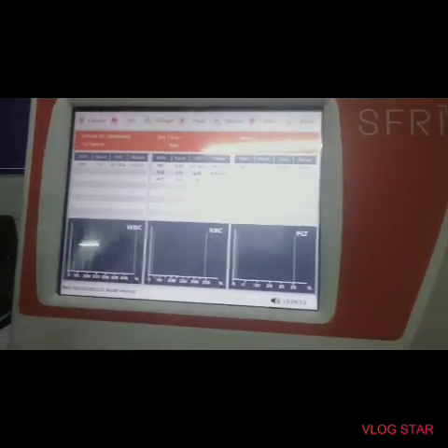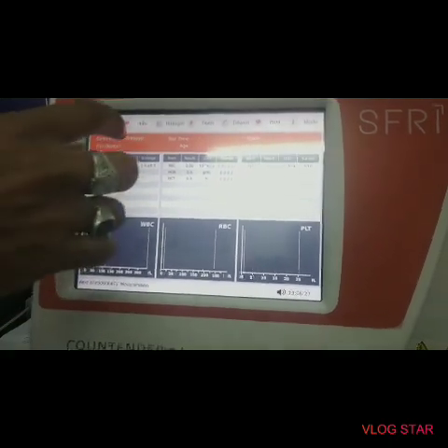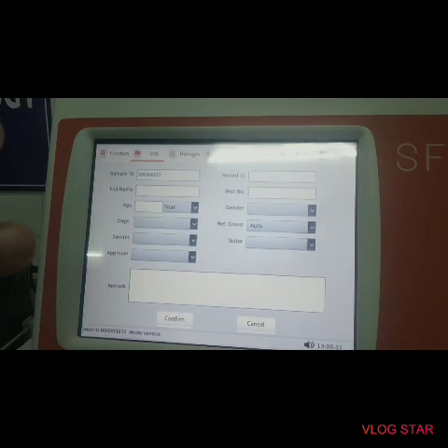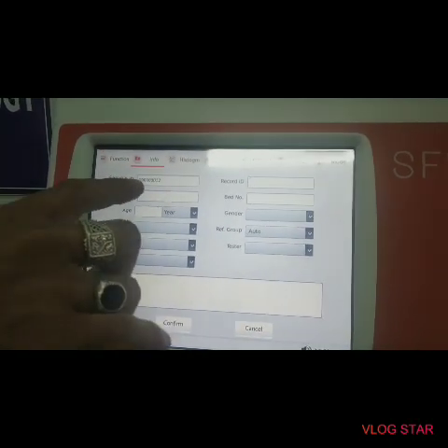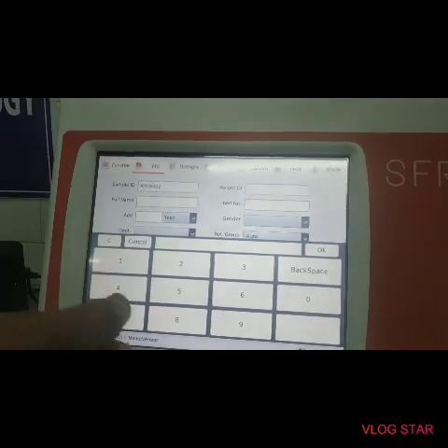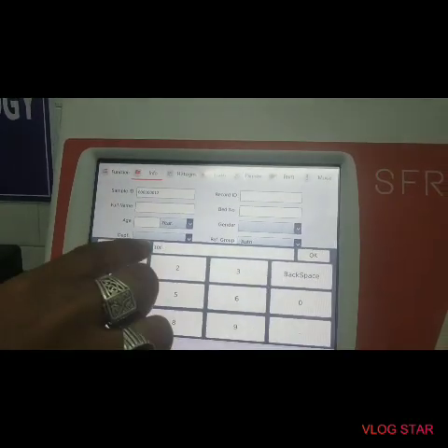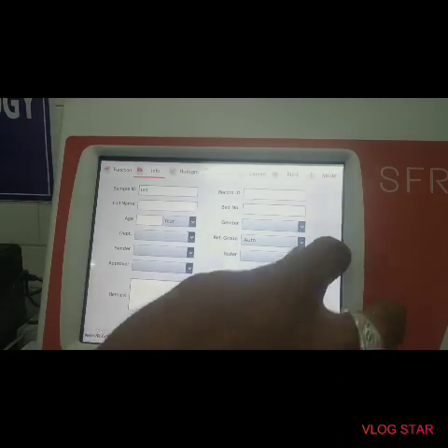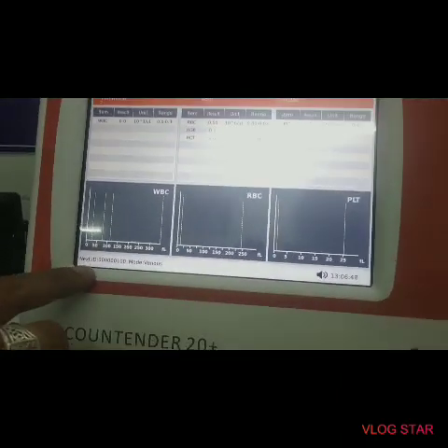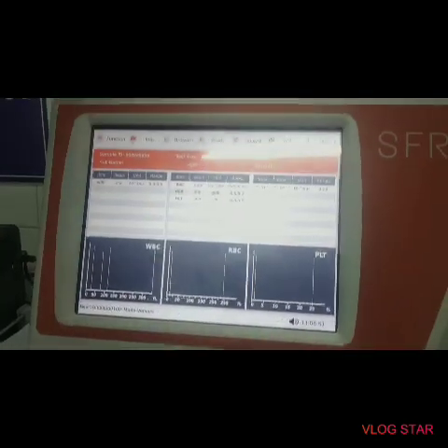As you can see, the machine is ready. If you have the sample, you will enter your info. That is not mandatory, but you will maintain the sample ID. If you have this ID, you will put it up to 100. If you have the next ID, you will change it. You will have my 100.